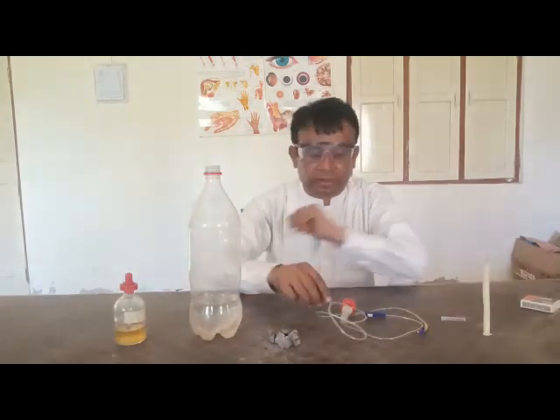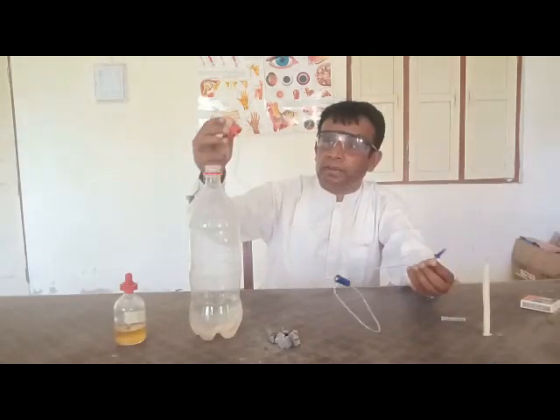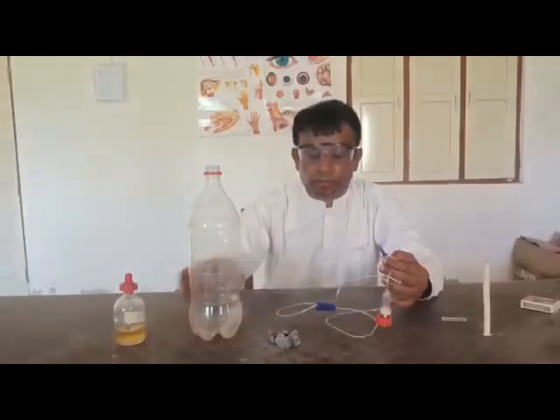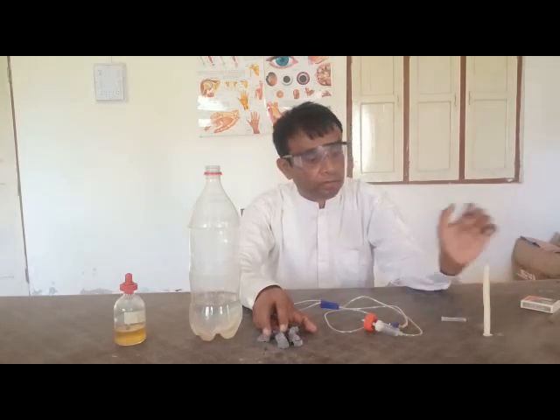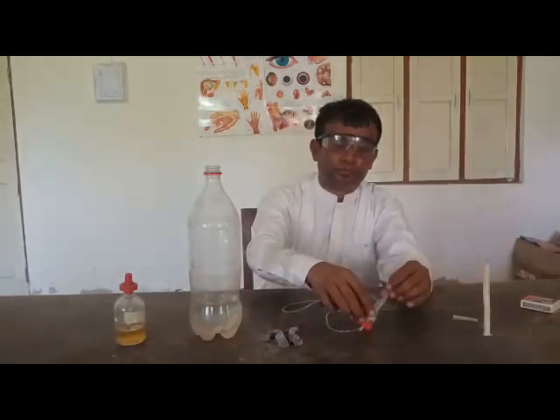So the gas we will collect through this drip pipe set, and the calcium hydroxide that will be there will change its color. The other chemical is calcium carbide, and the candle. So now start this chemical reaction.